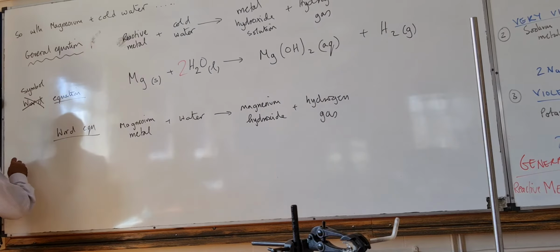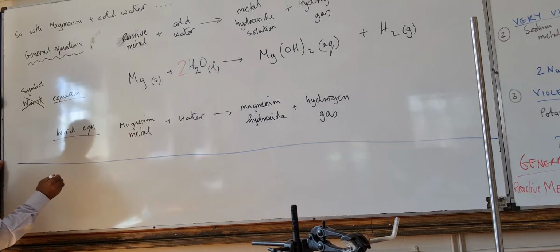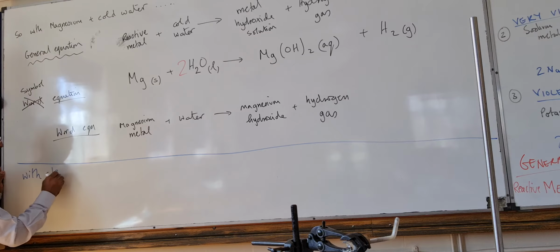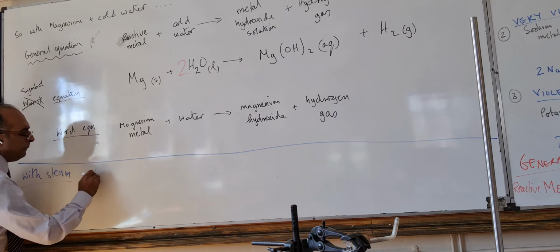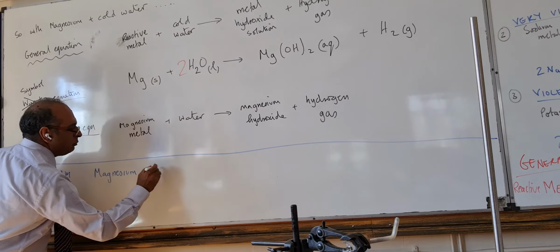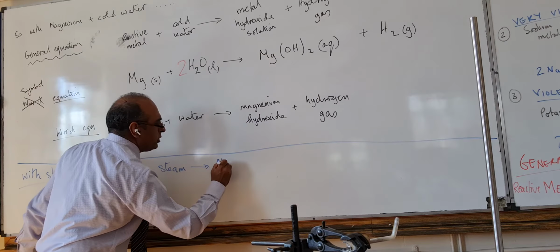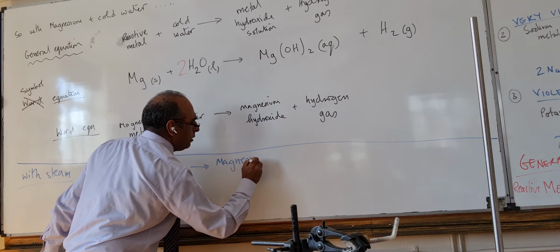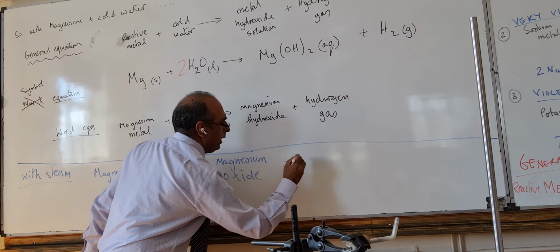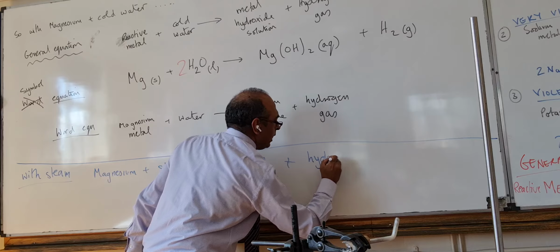So what happens with steam is, with steam, magnesium plus steam made magnesium oxide solid, and the gas you saw me burning at the end was hydrogen gas.